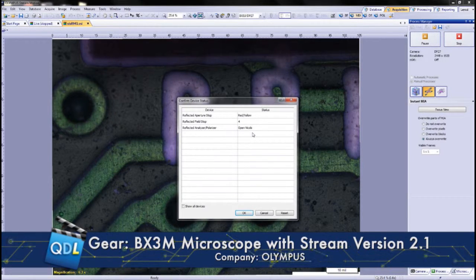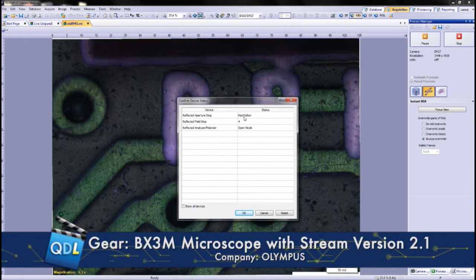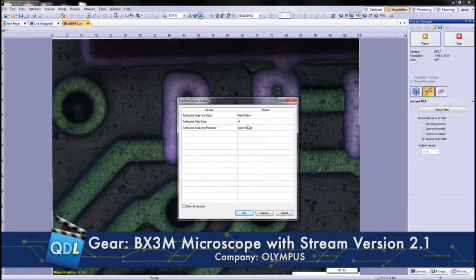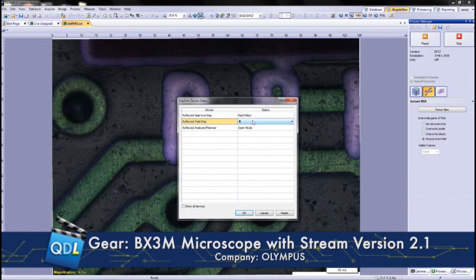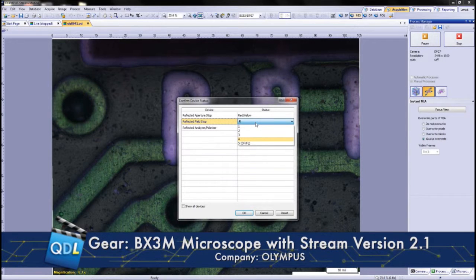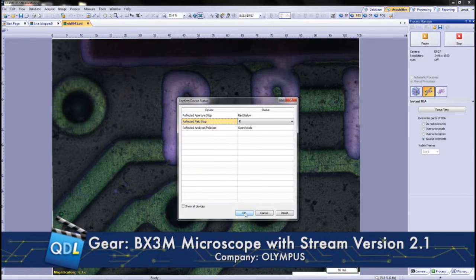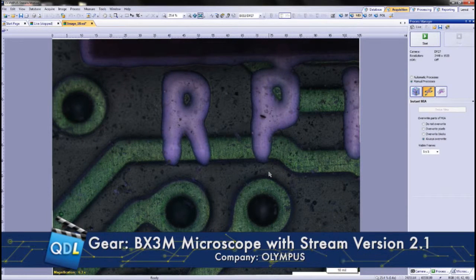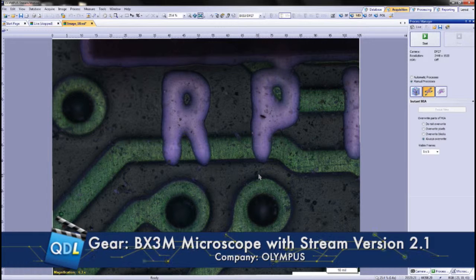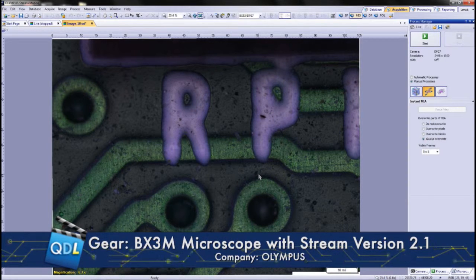When you capture an image, the software prompts the user to record all relevant information. For manual settings — like filters, aperture, or field stop — you can come in and select what's set on the frame. Once confirmed, it shows the full stitched image, which remains calibrated so you can perform manual measurements, circle to circle or point to point — all built into the Stream software.